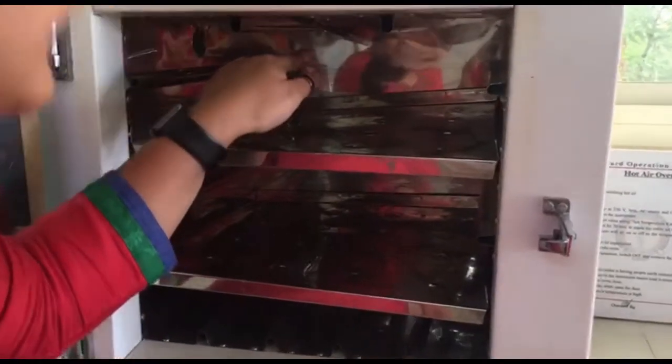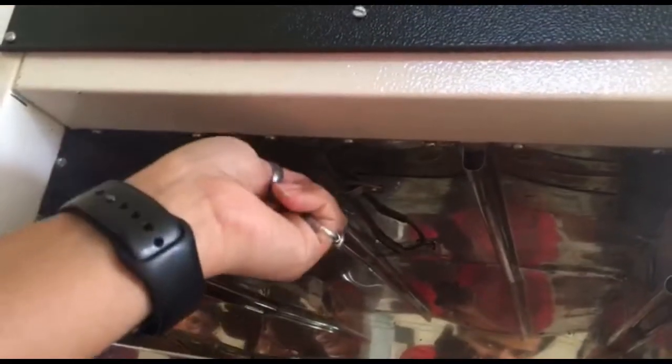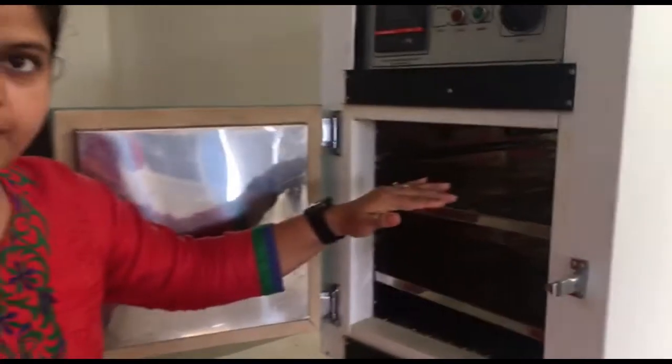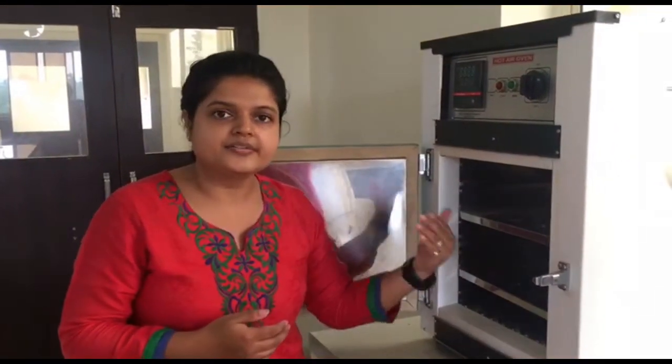When you get inside the oven you will find a slender element — this is known as the thermostat. The thermostat is for the control of the temperature. If the temperature of the oven increases then it automatically cuts off. If the temperature decreases then it automatically restarts.